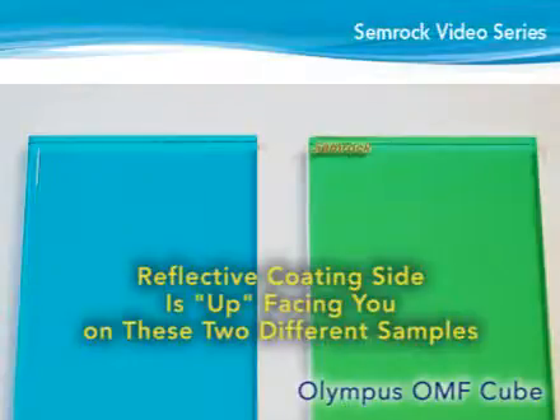If the dichroic does not have any marks, lay the filter flat on a clean white surface and look at the far edge of the glass. If the edge is not easily distinguishable through the top side of the filter, the reflective or coated side is up. If the edge appears white or uncolored, the uncoated or anti-reflective side is up.